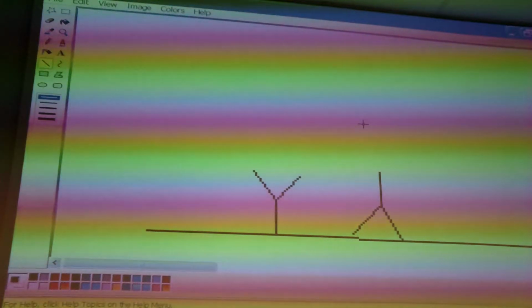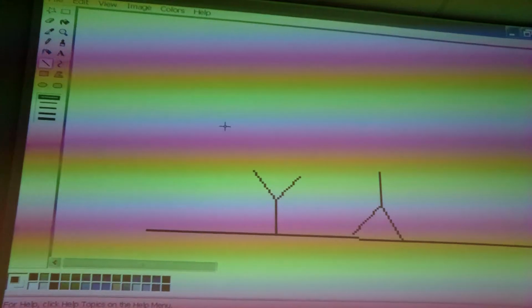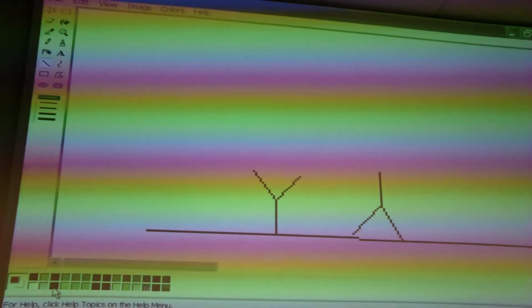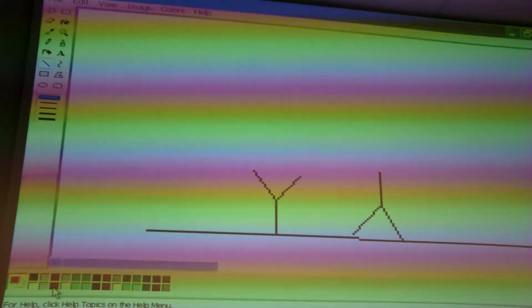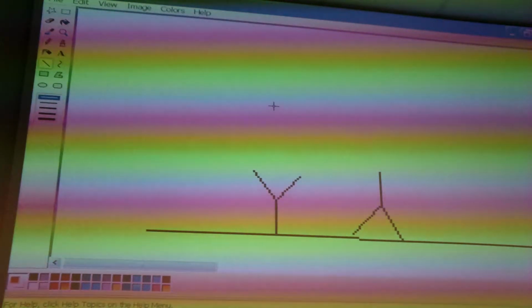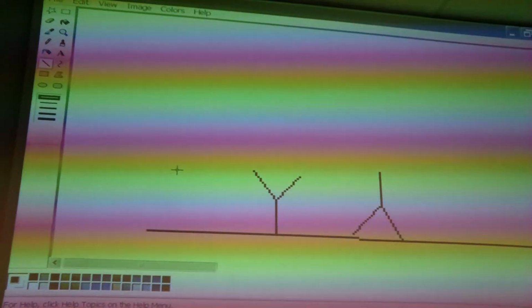Okay. Next step. You know something about ELISAs already. So what do we need to do next? We choose a different color. Add a secondary? The antigen? First you want to block the surface, so you have no nonspecific binding. Okay, that's good. We're going to block the surface.